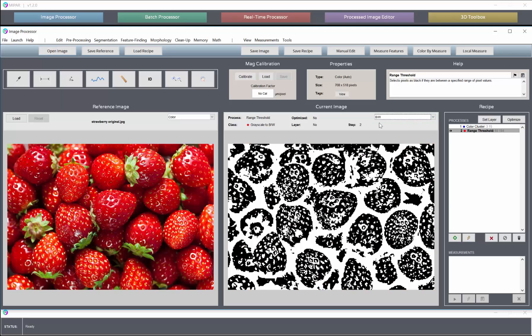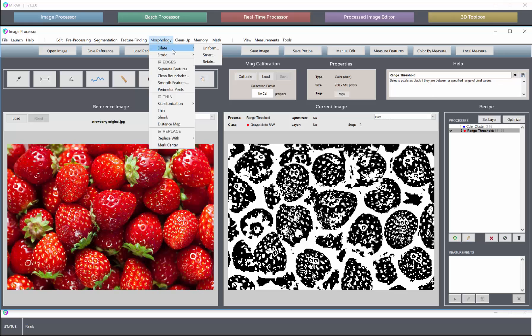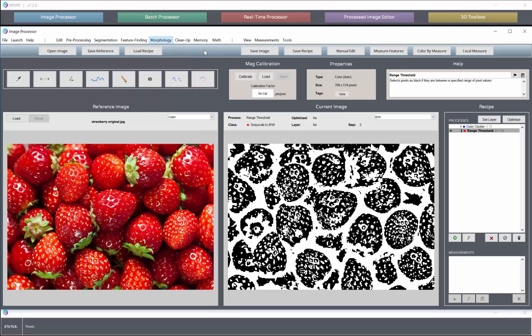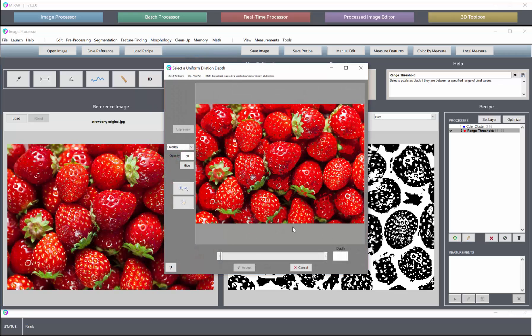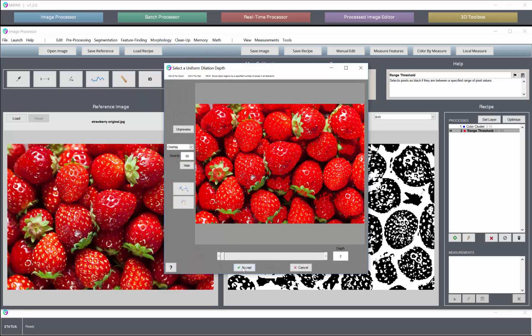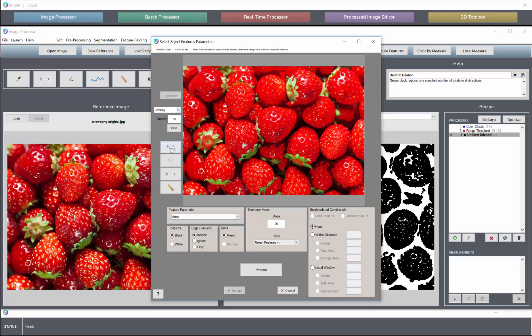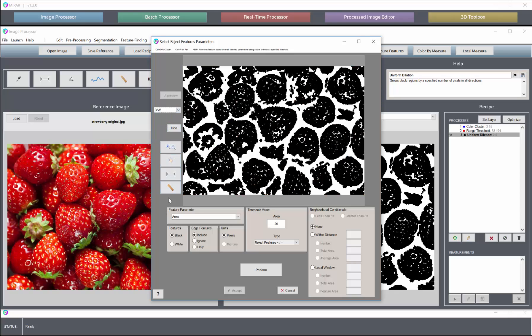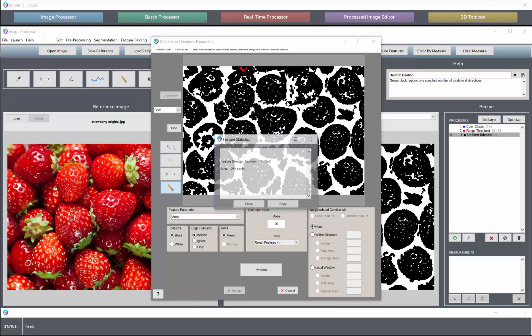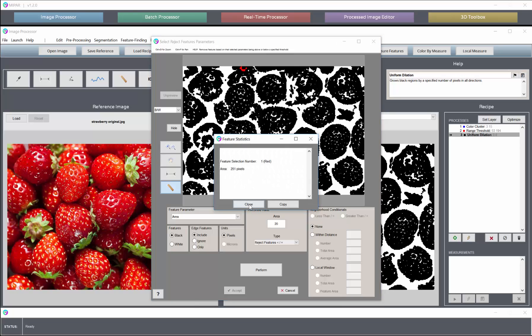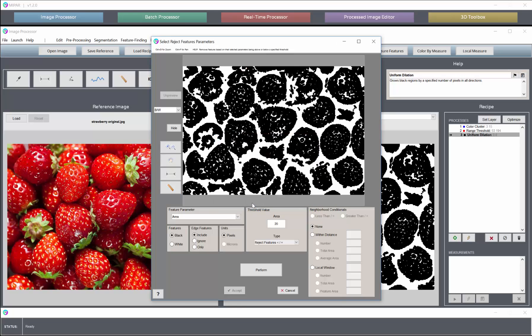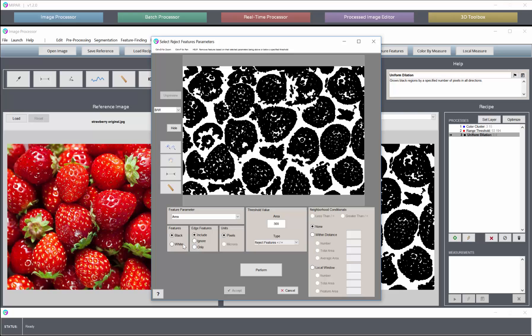And now if we go back here and we look in the binary view, we see that we may want to dilate our strawberries just a bit. And then perform some feature rejection. We can get rid of white features that are above a few hundred pixels.